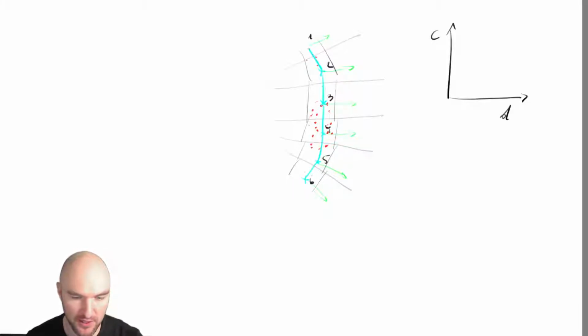And I think the first thing we're going to do is to calculate a 2D concentration map, yeah, which will then give us an idea of where we would look for higher or lower concentrations. And if you remember right, we've already calculated an isosurface, and we are going to go and pick one individual isosurface to do that.